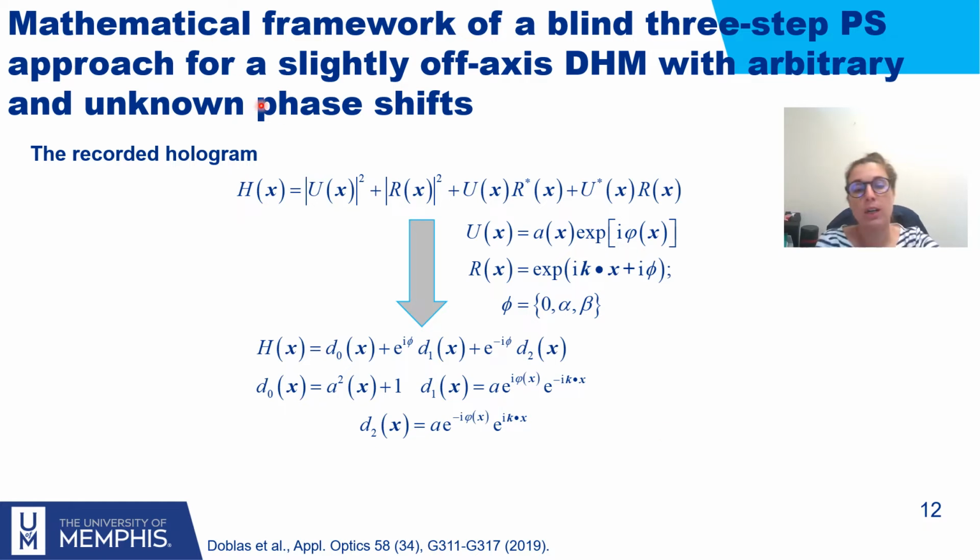Alright, so far we have talked about some phase shifting techniques. I'm just gonna introduce you to new phase shifting techniques that are kind of blind. They get the reconstructed phase image and the phase step by minimizing a cost function.